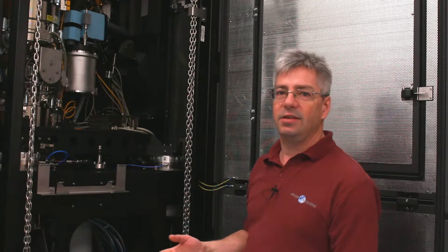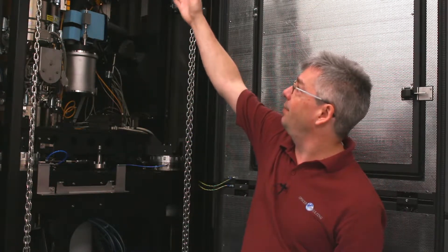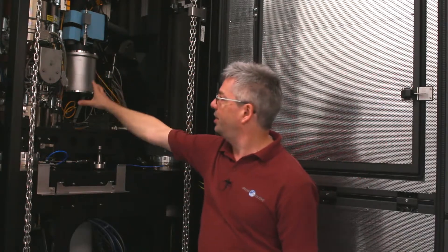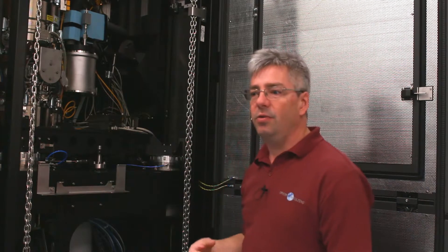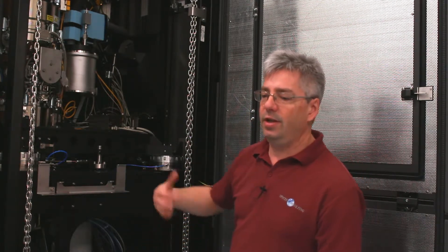The problem with cancelling fields for TEMs is that we need to cancel the field along the whole of this column. It goes from up there down to the sample chamber here, and we've even got a spectrometer underneath, so we can put double loop cables in to create uniform fields.